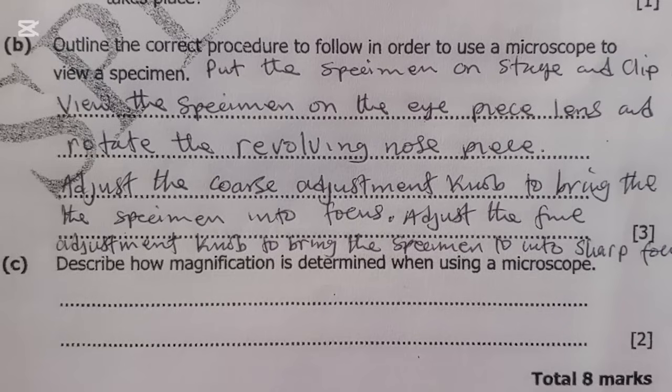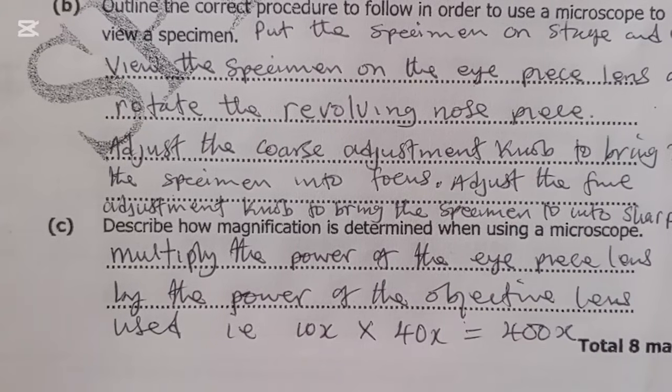So how we determine magnification is that we multiply the power of the eyepiece lens by the power of the objective lens which is used. So that is how we can determine magnification using the microscope.